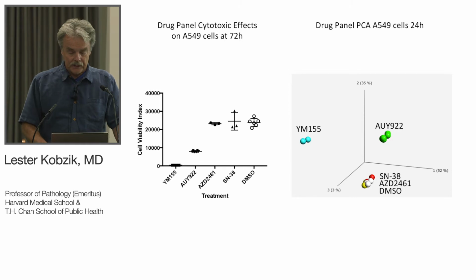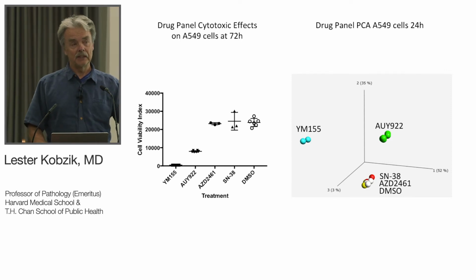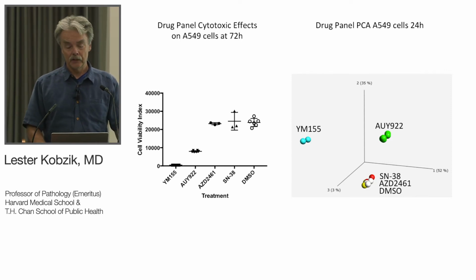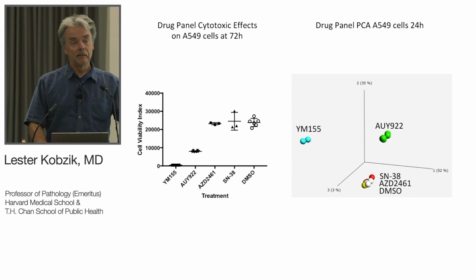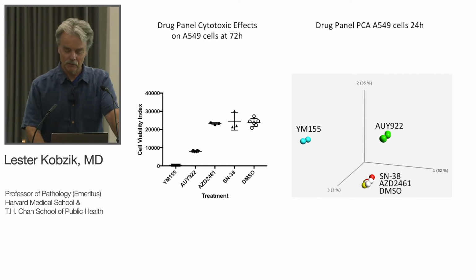Now, in this spirit of taking DriverMap transcriptome profiling and then playing with the subsequent data using available bioinformatic tools, one can keep going. And how many of you here do some bioinformatic analysis of RNA sequencing data or genomic data? At least one person? At least 2, 3, okay. The rest of you are too shy to admit it, but you probably do it too.